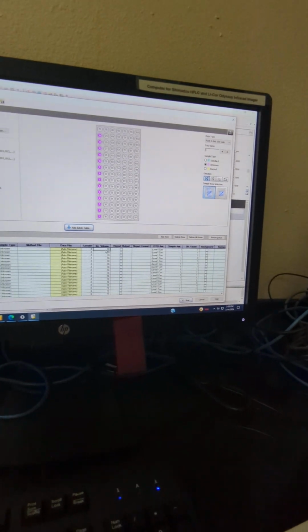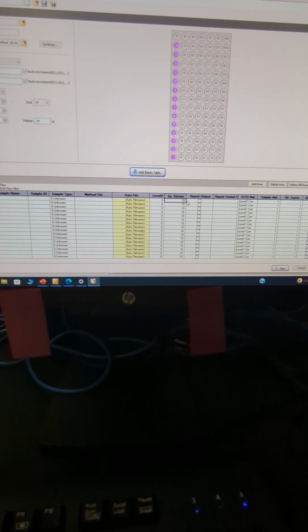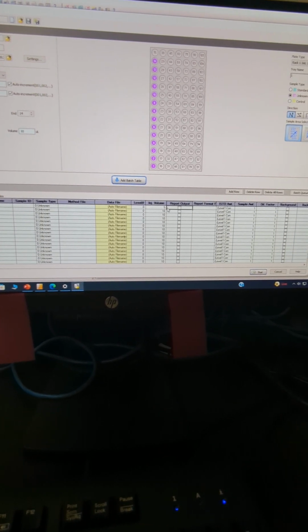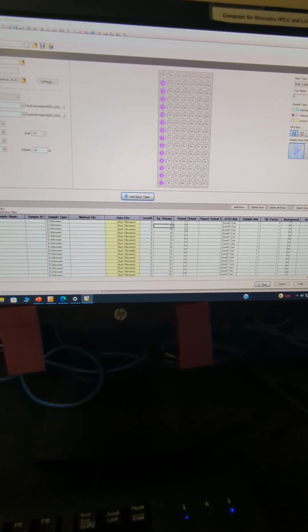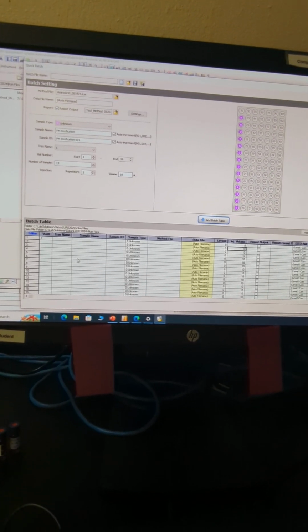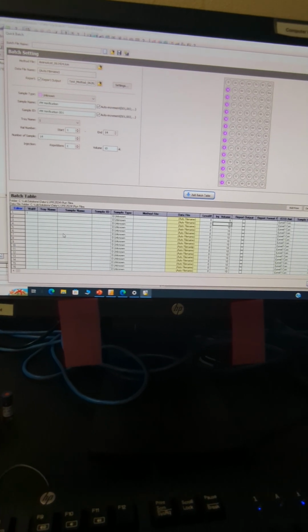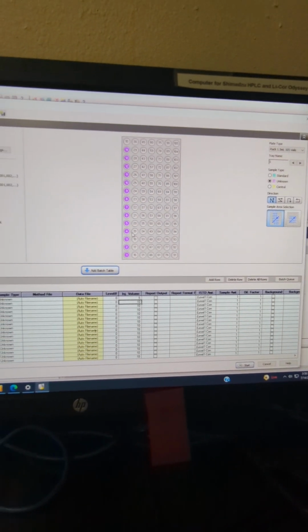I think we'll just inject maybe a few microliters to just make sure that we're kind of seeing some differences here. We'll start with 5 and we'll see how that works, and this is what we'll try to run tomorrow. So I'm going to fill this out. We'll have this ready. If it doesn't work, then we can re-upload the parameters and redo this tomorrow. But this is what we should do.